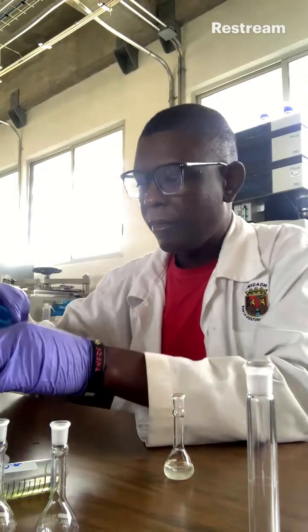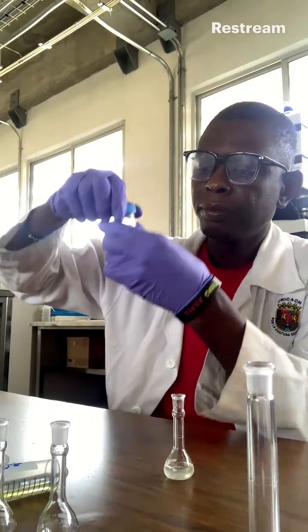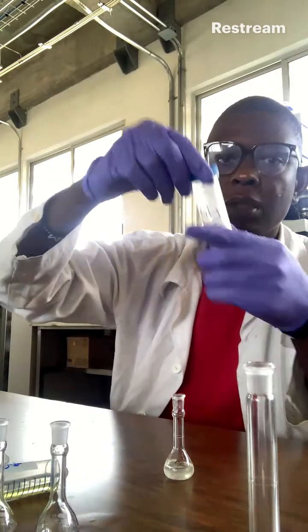All right, so I've taken 5 ml of this to prepare the sample. I'll keep it back.